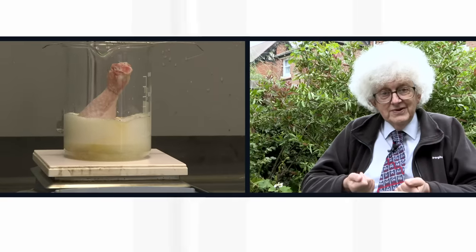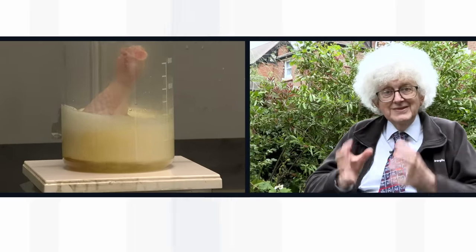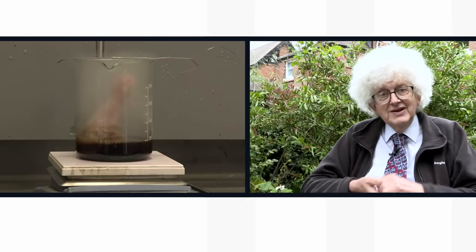Professor, why does the sulfuric acid's removal of water help the H+ do such an effective job? I think it does several things. First of all, the reaction with the acid heats everything up, and when you heat up a reaction, it goes faster. Secondly, it produces this finely divided carbon, which has a large surface area, so it can be attacked much better than if you had a solid lump. And the H+ can then have got the peroxide primed so that it's ready to attack.